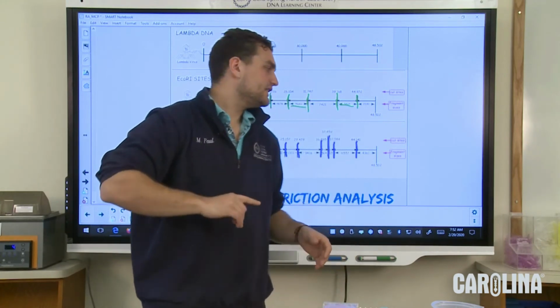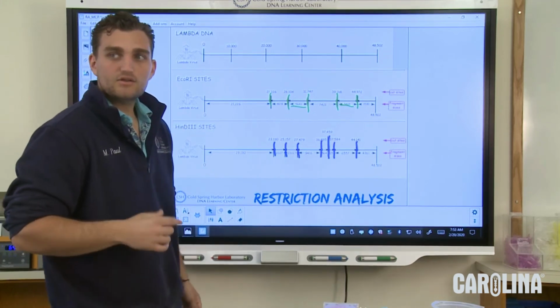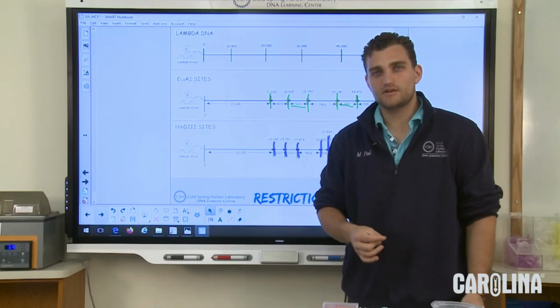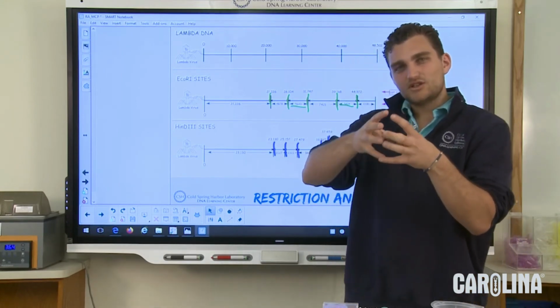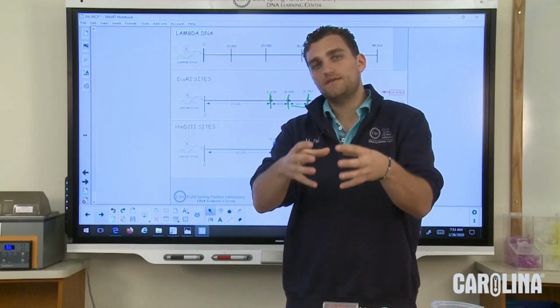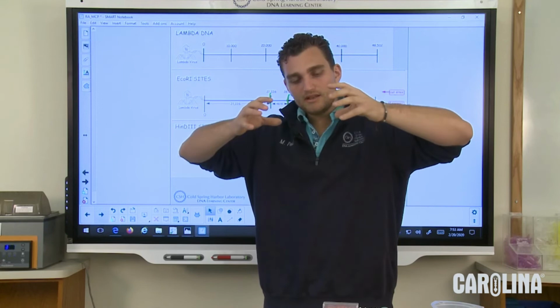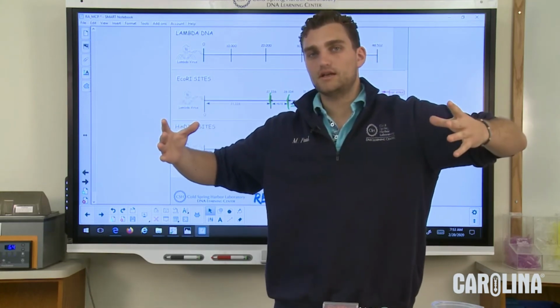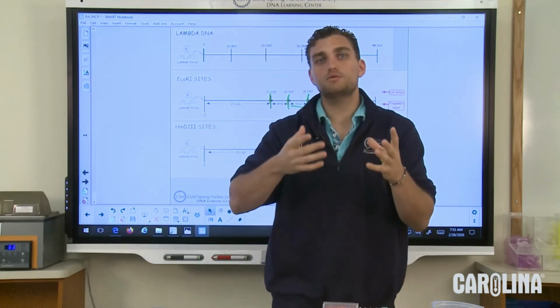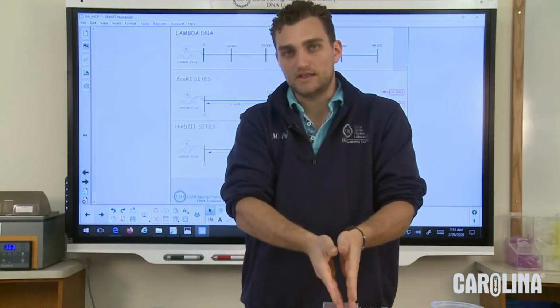The 564 fragment right next to it is also an interesting thing. We do see it sometimes. However, it's simply so small. There's only 564 base pairs where the SYBR Green can really bind in there. So it doesn't create a strong fluorescent signal. If it doesn't create a strong fluorescent signal, we don't have enough photons for it to register to our eyes that there's actually a piece of DNA there.